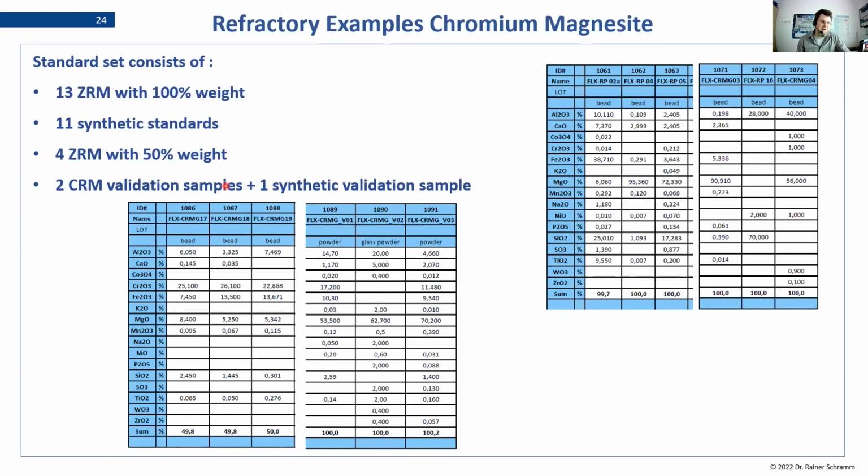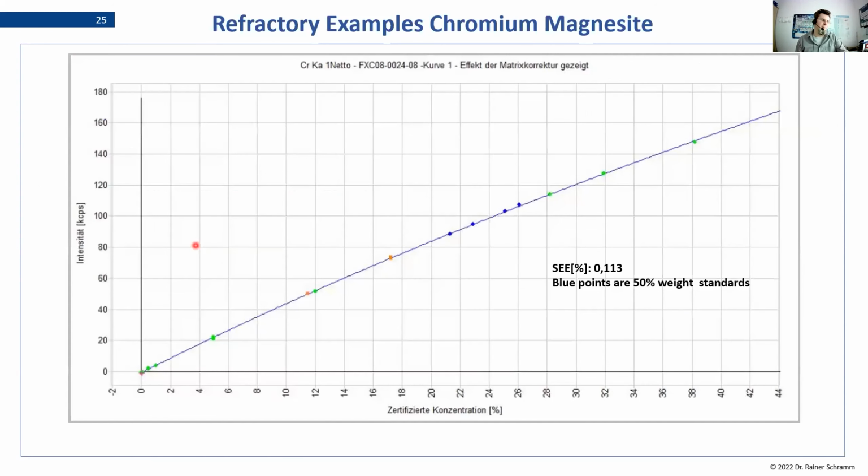And the trick basically is that when calibrating this in the curve, by doing this, we call it double dilution here, which is not completely correct, but since you're using only half the sample, it kind of describes the purpose. Calibration-wise, this is our curve. And you see here the blue points in the middle are the ones which have 50%. So these are the ones that are not 0.5 gram, but 0.25 gram of sample material. And all the other ones are 0.5. And you can see by the bending, this is done then also quadratically, but I think it's the details.